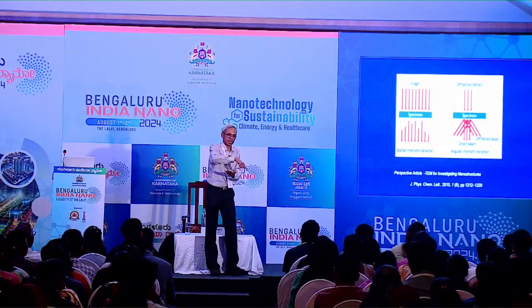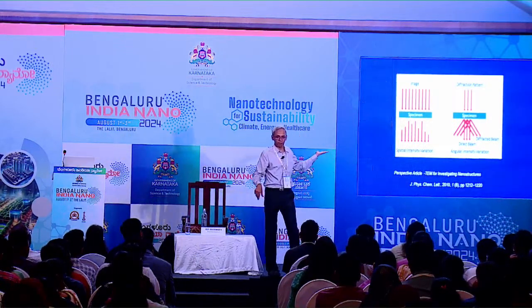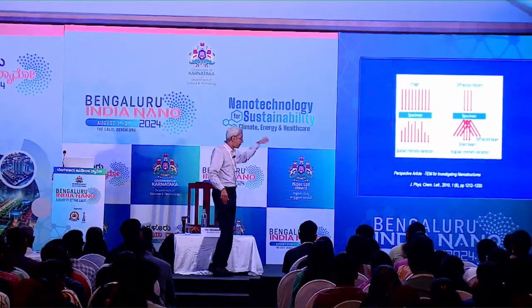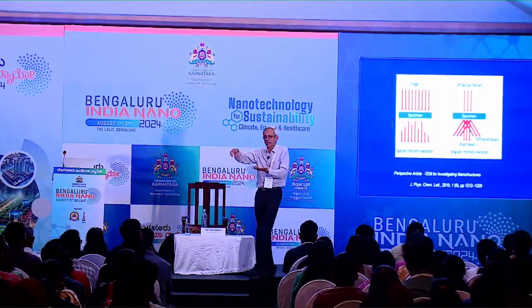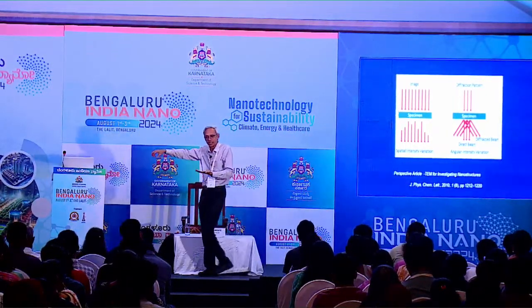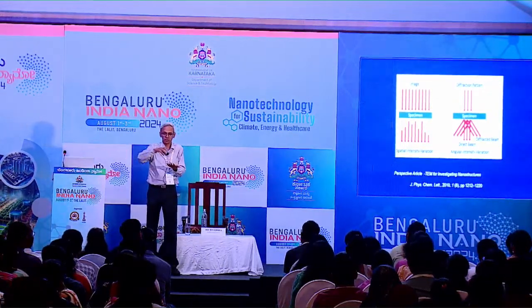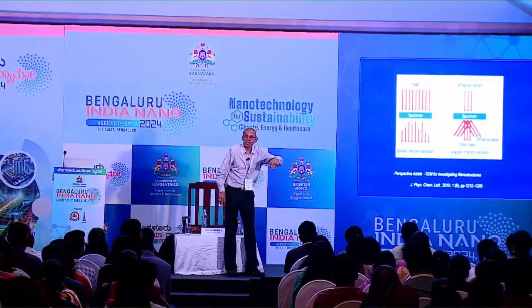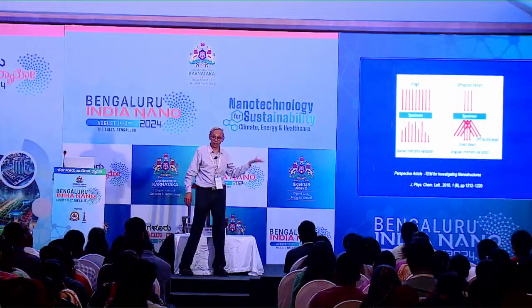Each point in the electron diffraction pattern refers to a beam going in a different direction, at the same Bragg angles that correspond to the lambda that we have. Because of this angular intensity variation, different regions of the specimen may scatter or diffract differently. Therefore, like I told you, you get dark and bright regions, a spatial intensity variation. Some regions will appear dark, some regions will appear bright. This spatial intensity variation is what we call an image.